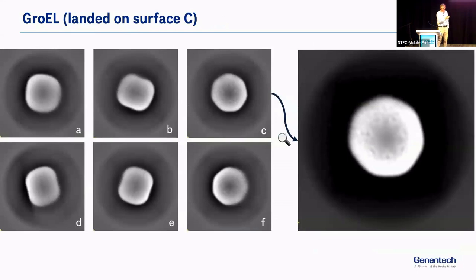This is amazing contrast microscopy. Really, in an individual image, you should see all the features that Helen was showing yesterday. Very clear double barrel. On the top views, you should see 7-fold symmetry. The best we can do at the moment is, if we average a much larger number of particles than we should need to, we can sort of see 7-fold symmetry near the core, but not through the structure.